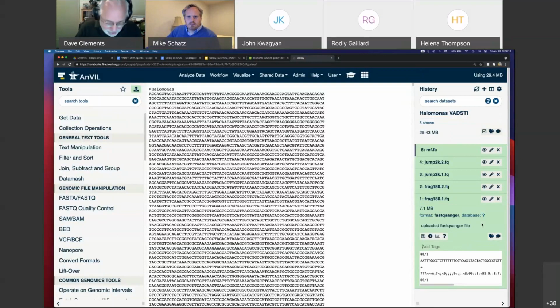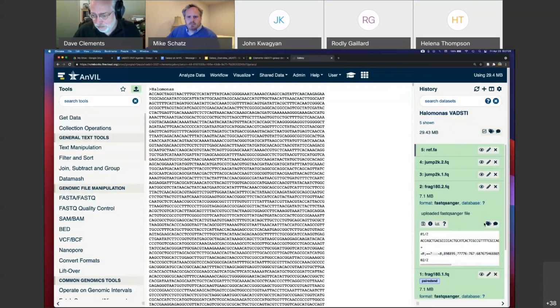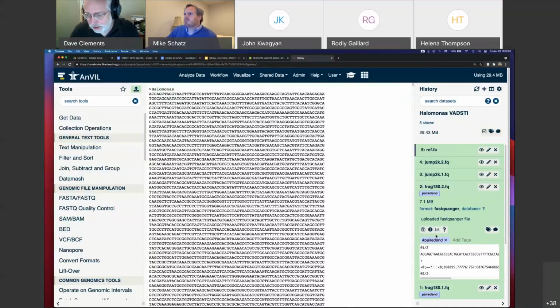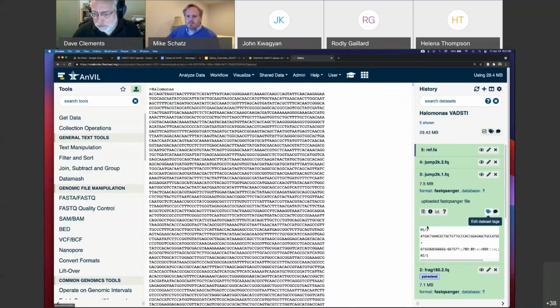Okay. And I'm going to say paired end. Paired end. I'm going to come up here and do the same thing. Paired end. Hopefully I spelled it the same. Yes, I did. Come here. I'm going to do that. And I'm going to say mate pair, because this is the mate pair. Mate pair.